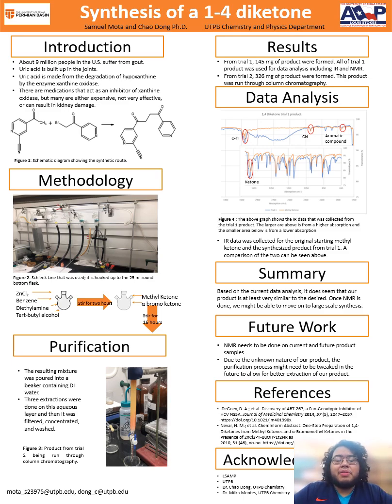These past 8 weeks I've had the privilege of working with my mentor Dr. Chao Dong on the synthesis of a 1,4-diketone as a precursor to a drug used to treat gout.